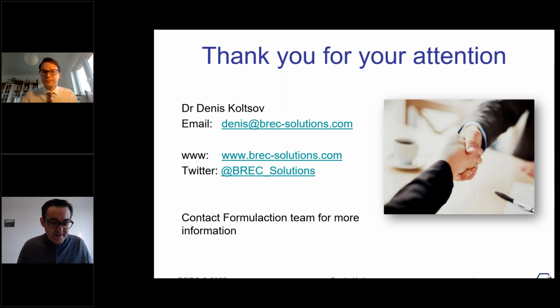Thank you, Denis, for the presentation. We got a couple of questions. I could catch some questions during your presentation, Denis. You can either answer the questions or I can manage as well, as you want. There was one interesting question, which was, can you measure mean particle size change over time with SMLS or that technology? Do you want to take it?